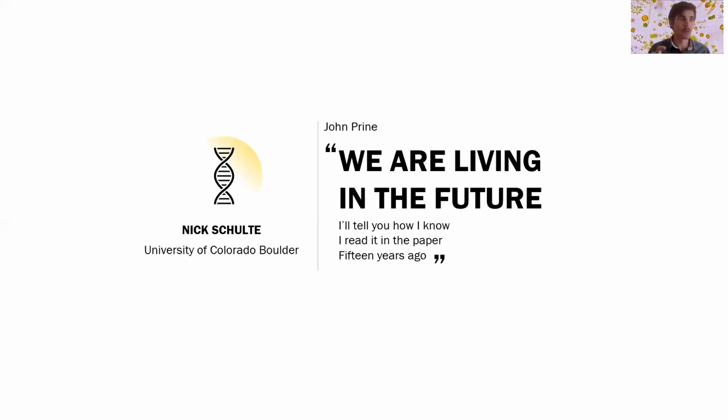However, in most extraction methods, there's either a physical or chemical process that's forcing these frustules open. And so far, based on the results, it doesn't seem like there are any taxon-specific, glaring holes in taxa that we're unable to recover using those processes. So I would say that for the most part, that's not a major issue.